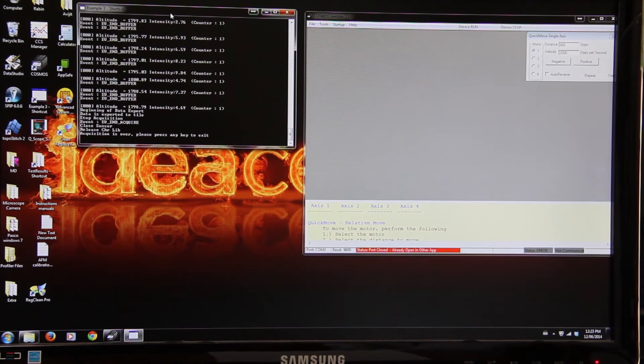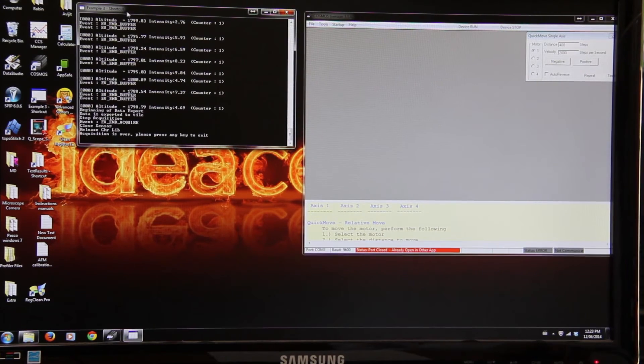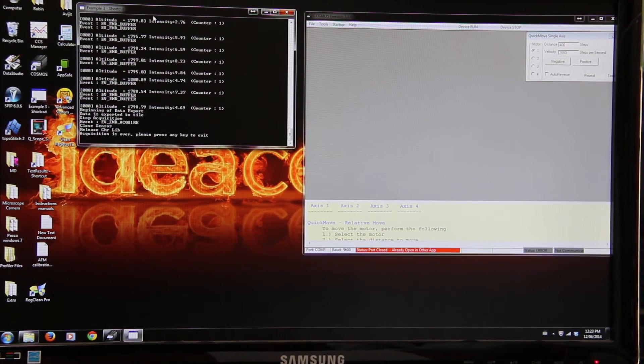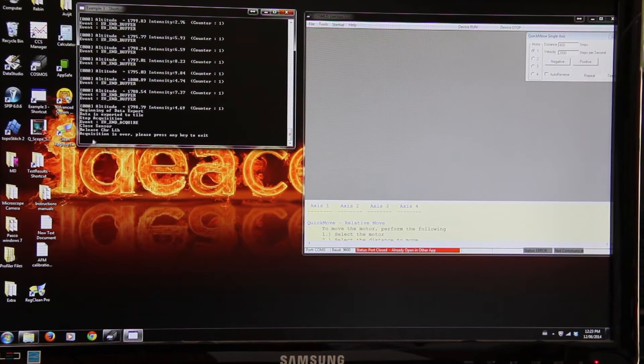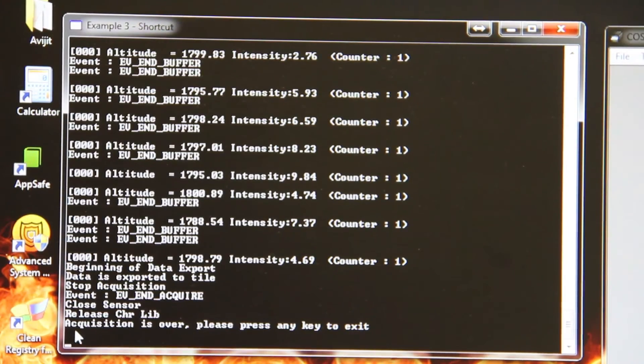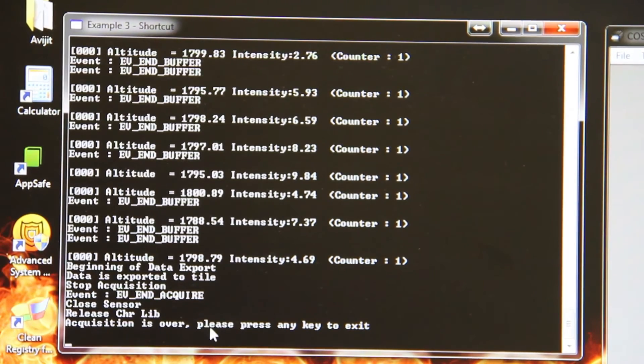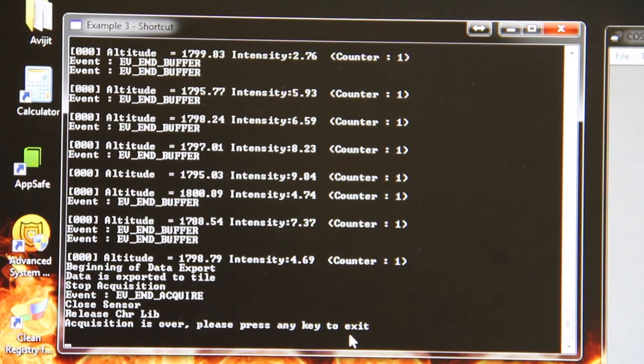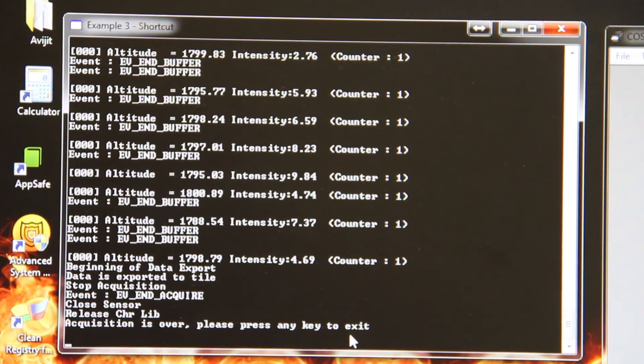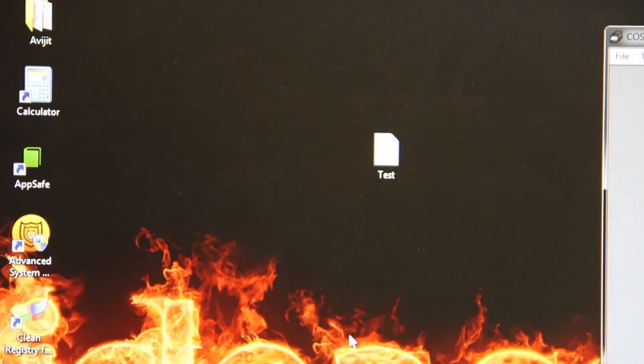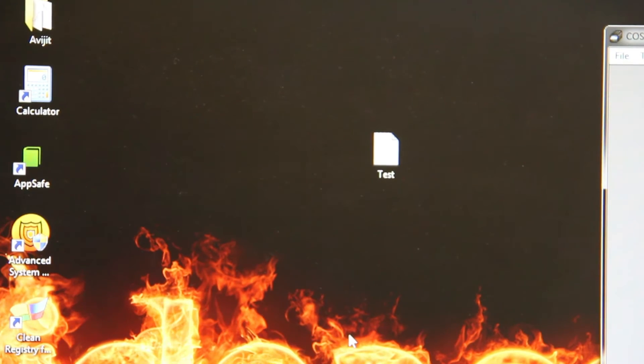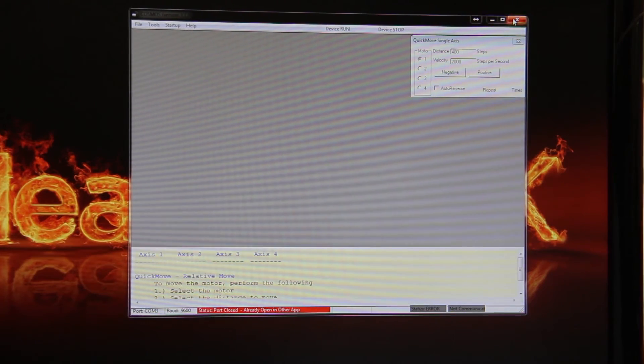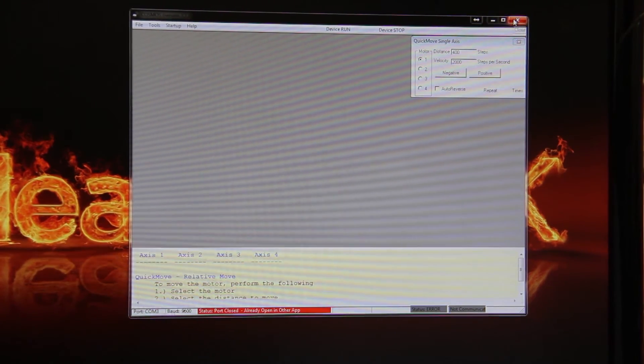After the test has been done, you can see in the example 3 shortcut acquisition is over. Please press any key to exit. Close the example 3 shortcut. Close Cosmos from desktop.